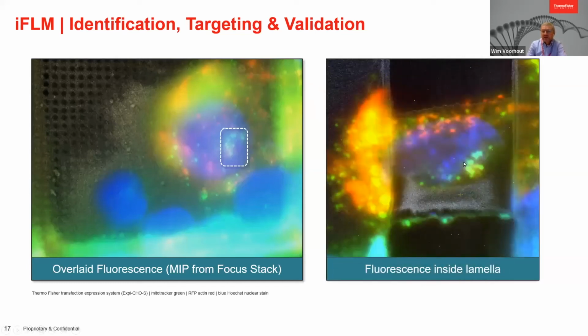So this is a fluorescent image, and you can see that we're still in an area where we have quite a few mitochondria. It can also help you to identify the area where you want to take your tomograms later on in the cryo-electron microscopy.